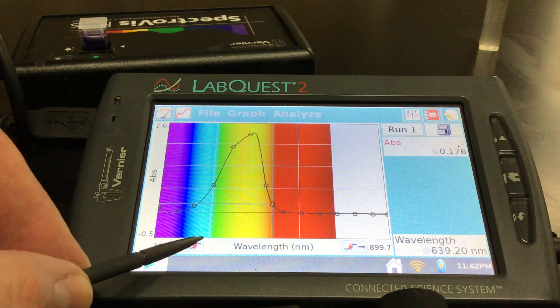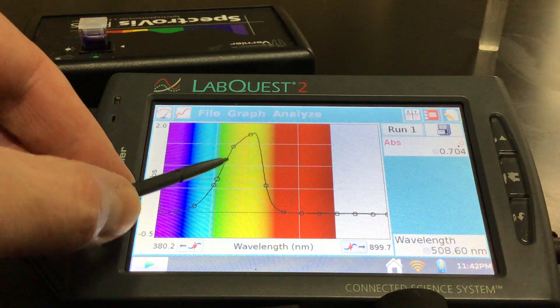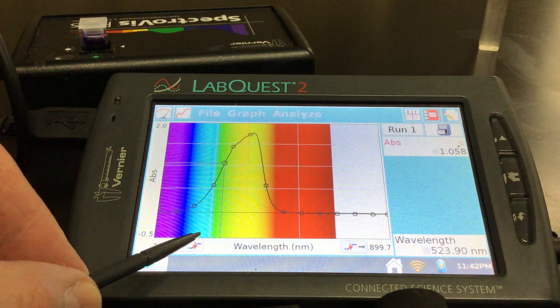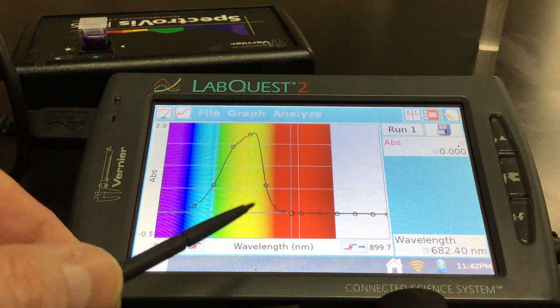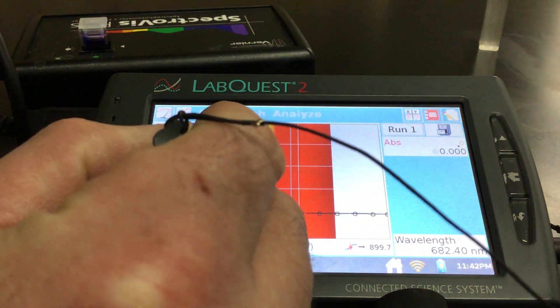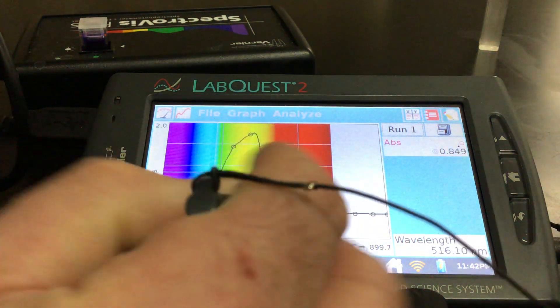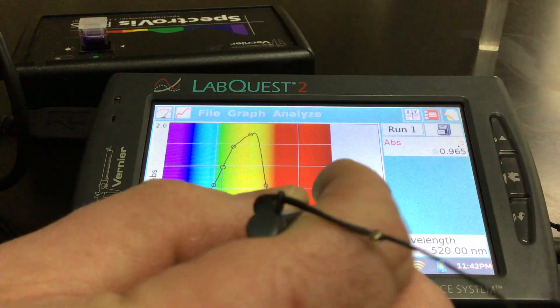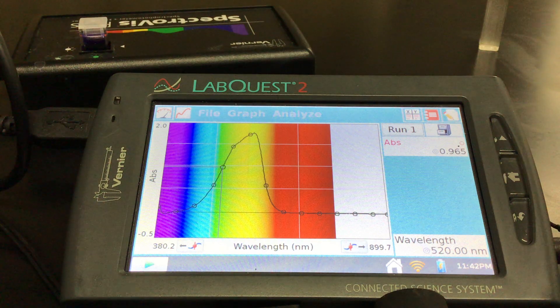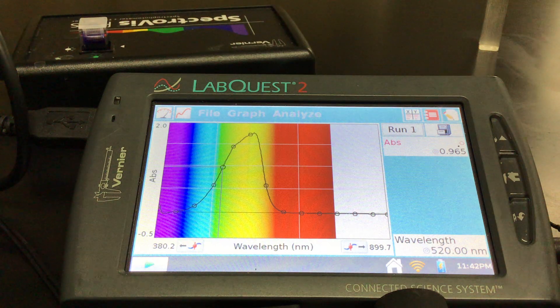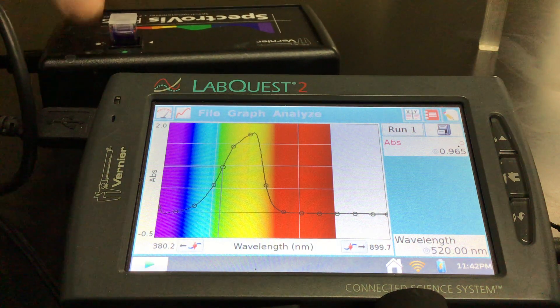We know in this lab that we're going to be mixing our crystal violet with our sodium hydroxide, and our concentration of our solution is not going to get darker, it's only going to get lighter. That's why I can feel free to choose my wavelength at an absorbance of 0.96.